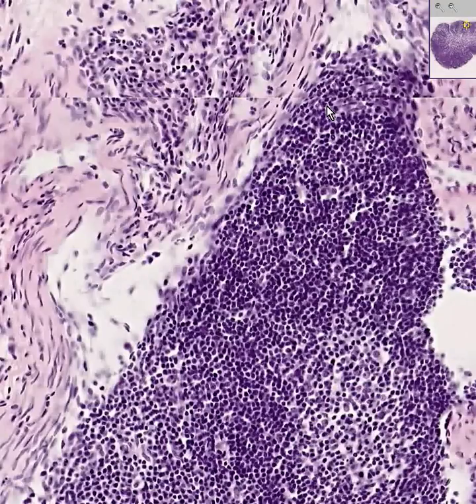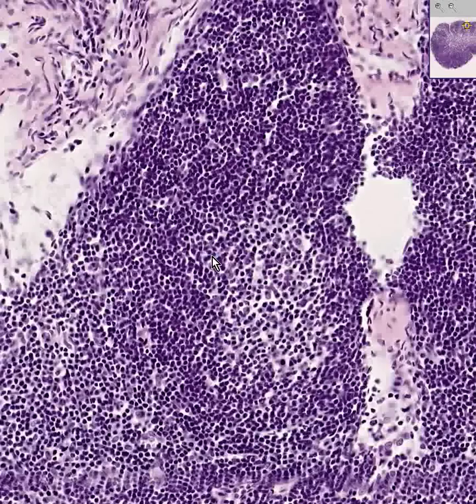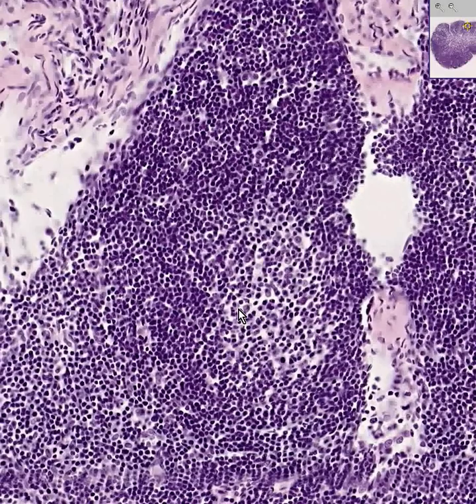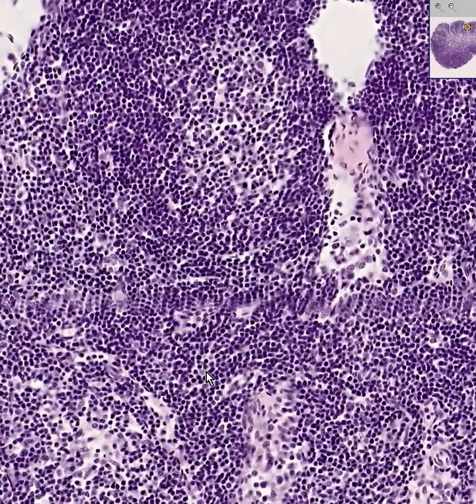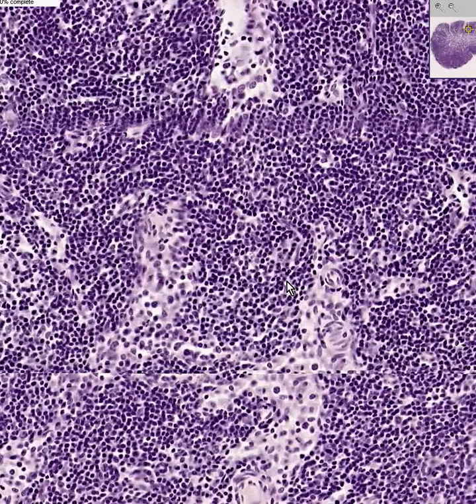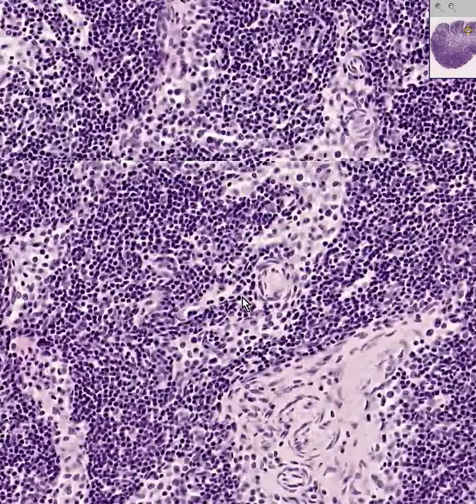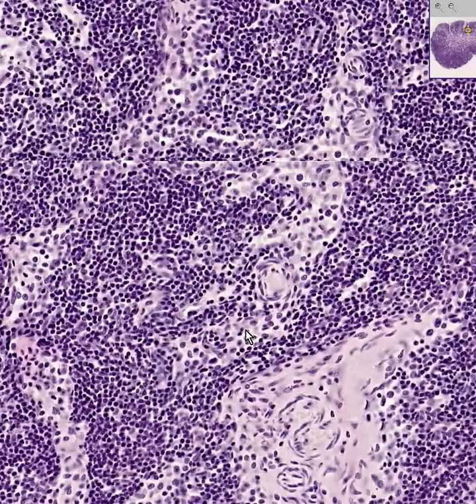So let's review some of the cells. Here are fibroblasts and collagen fibers. Here is a lymphoid space, probably a subcapsular sinus. This area is 100% lymphocytes; these are probably also 100% lymphocytes, with maybe some looking more like classical plasma cells, which we will discuss later. And here we are now towards the medulla of the lymph node, which does not classically contain too many nodules — here you have medullary sinuses, which are the lighter areas, and medullary cords of lymphocytes, which are the darker areas.